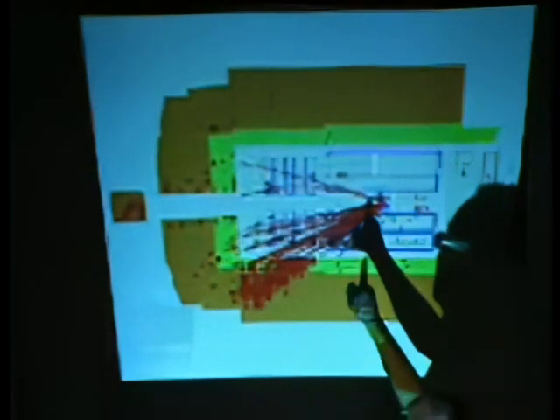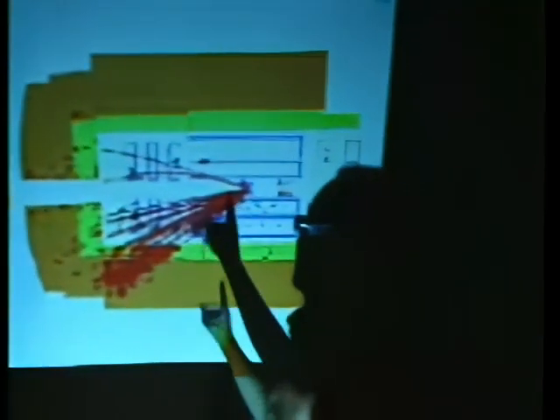Now, this is the tantalizing thing. As they say, one swallow doesn't make a summer. There are 10 million pictures I could have shown you where the electron beam here sort of went off. Oh, you can't see that, can you? No, you can't, sorry. The electron beam coming in here goes off in this direction most of the time, and the further away you get in angle, the less the chance. And beyond here, you have to wait lots of times, and then there's almost nothing, and then suddenly you get one back there and another one like that. Is this just the tail of a vanishingly small distribution, or is it the beginning of something big?